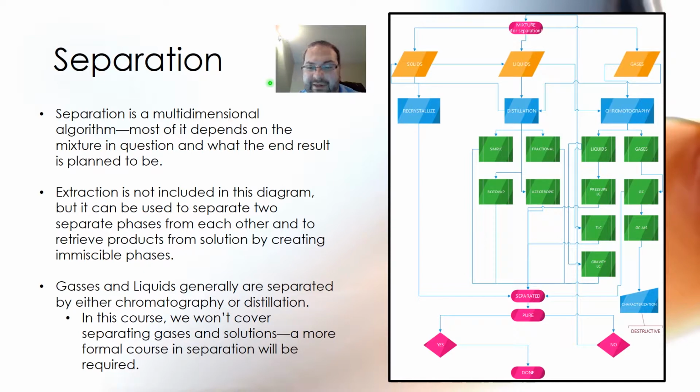There's a separation that occurs, and then after the separation there's a workup with acidification, and that acidification releases inorganic elements into an aqueous medium that may or may not be soluble entirely, but that leaves you with an organic phase on the top that you can then extract and separate. So it will all be integrated together in some cases, and you have to do it step by step.